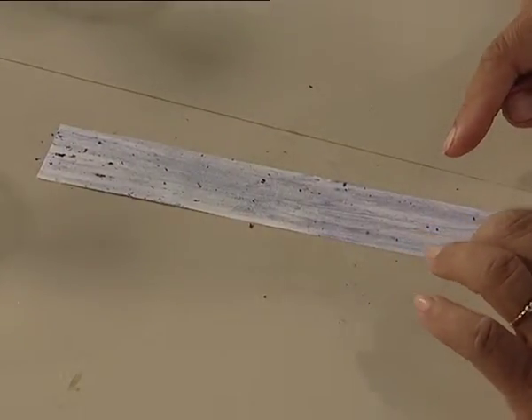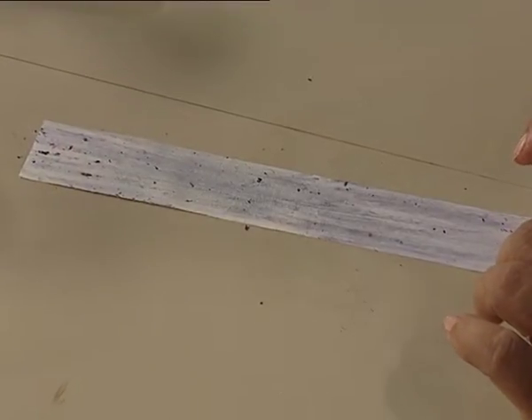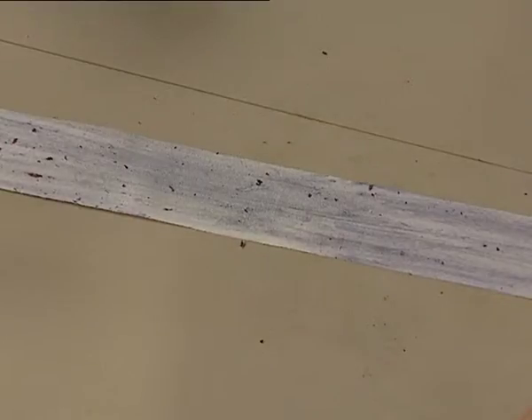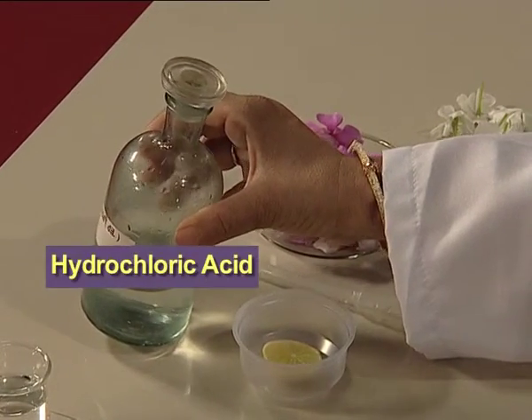Can you see the white paper colour has changed to light purple colour? Now we will test it with a drop of acid. Let us see if we observe any colour change — I am using hydrochloric acid.